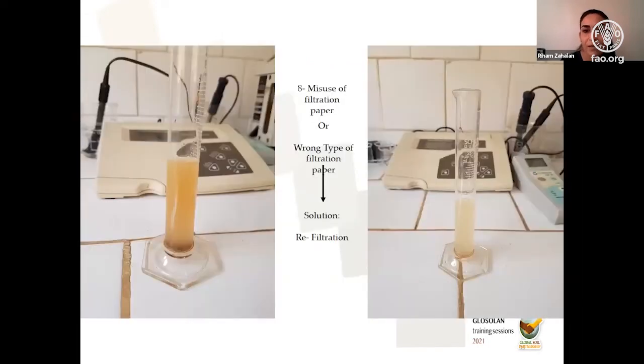It's not a clear extract. So in this way, we need to repeat the filtration process, and it will consume time. It's very costly because I'm going to need extra filtration paper. So I don't want to get to this point. I just make sure that I use the right type, I place it in a proper position, and then I'm going to get a clear extract.